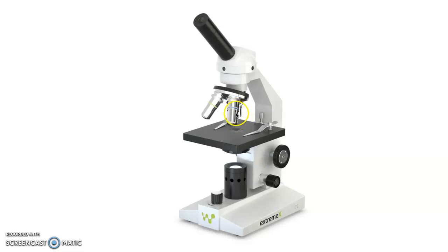This one has three objective lenses. We have some microscopes that have four objective lenses, but we don't really need more than three. If the eyepiece is magnified at 10, down here you have these three objective lenses: the smallest one is 4, then you have a 10 and a 40. If you're looking at a slide while the 4 is down here, it means whatever you are looking at is 40 times magnified because you've got 10 multiplied by 4.